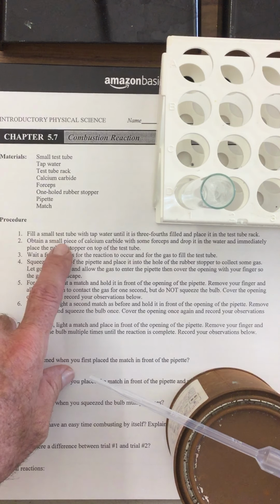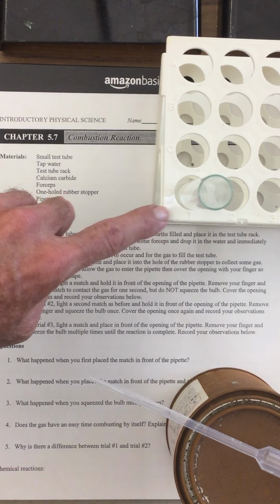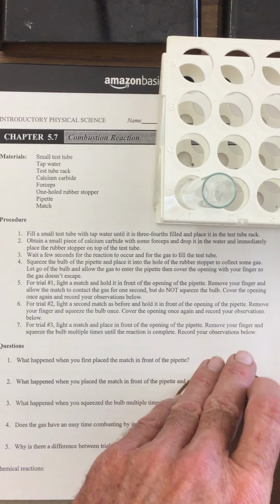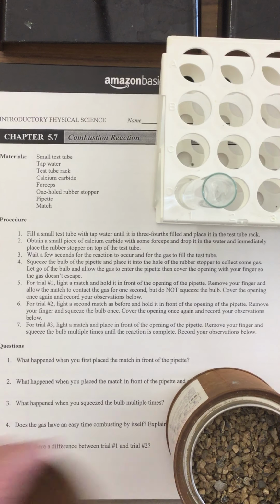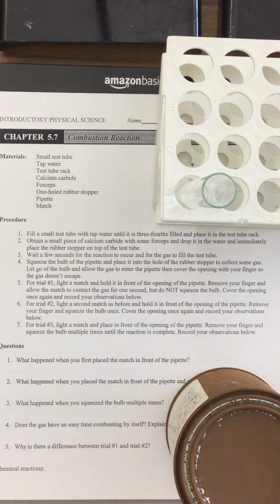So this says to fill a small test tube, here's the test tube, with some tap water, and we're going to place it in our test tube rack. We're going to obtain a small piece of calcium carbide. Let me show you what calcium carbide looks like, these rocky substances. And I'm going to take some forceps or some tweezers, and I'm going to drop it into the water.